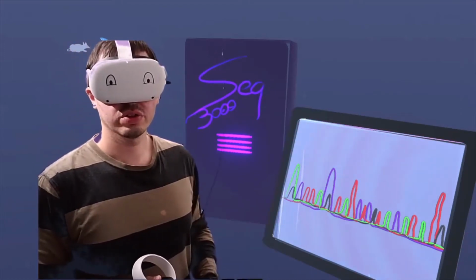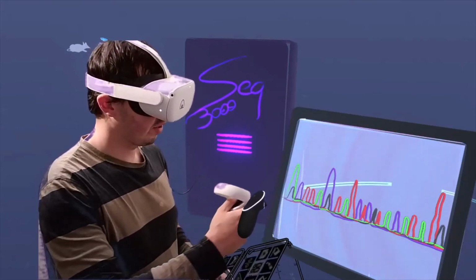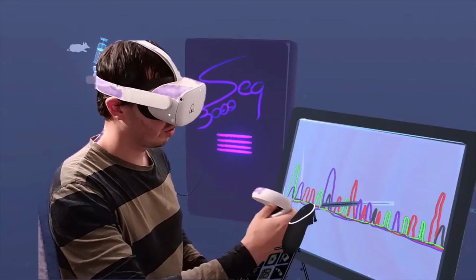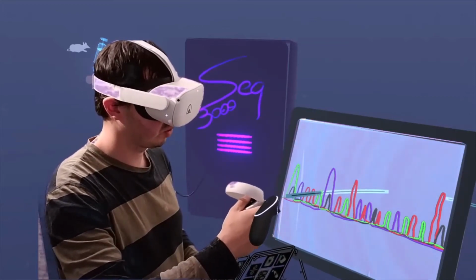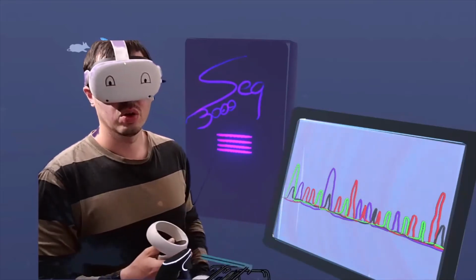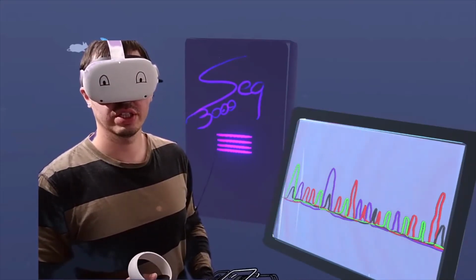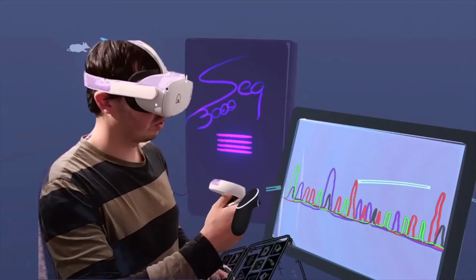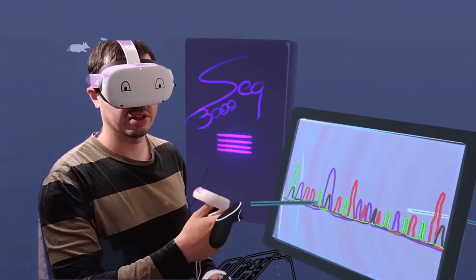Why are there several heights of peaks? Well, you have, in general, a single height, which is the unit. It says 1 times A, 1 times G, 1 times C, etc. When you have twice the same nucleotide in a row, then it gives you a peak which is double the height. This is the reason why some peaks are higher than the others.